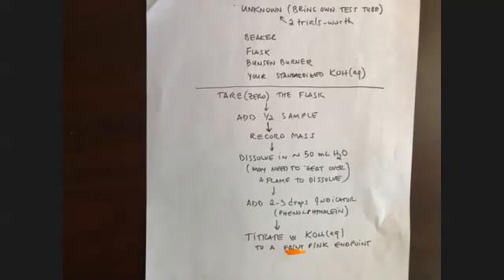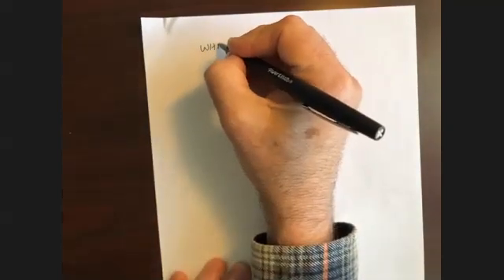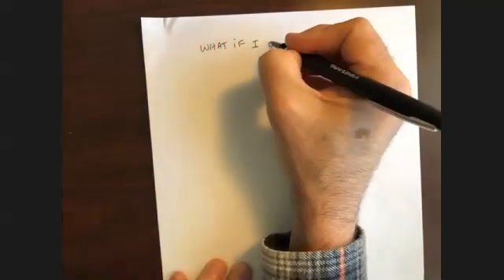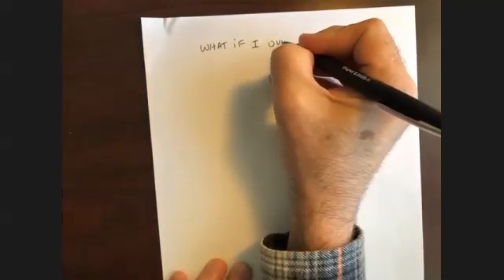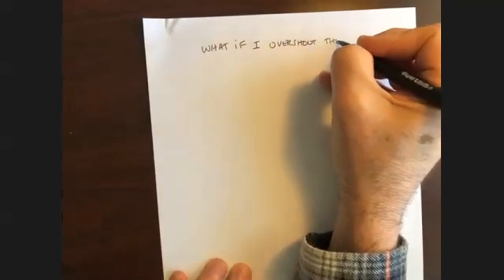Well, so what happens here in this experiment? What if I overshoot the endpoint?